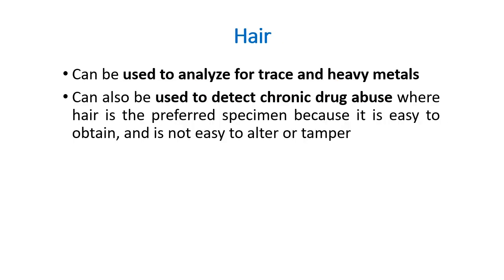So the hair, it is used to analyze trace and heavy metals, used to detect chronic drug users. Bakit ang hair ang ginagamit? Because it is easy to obtain and not easy to alter or tamper.